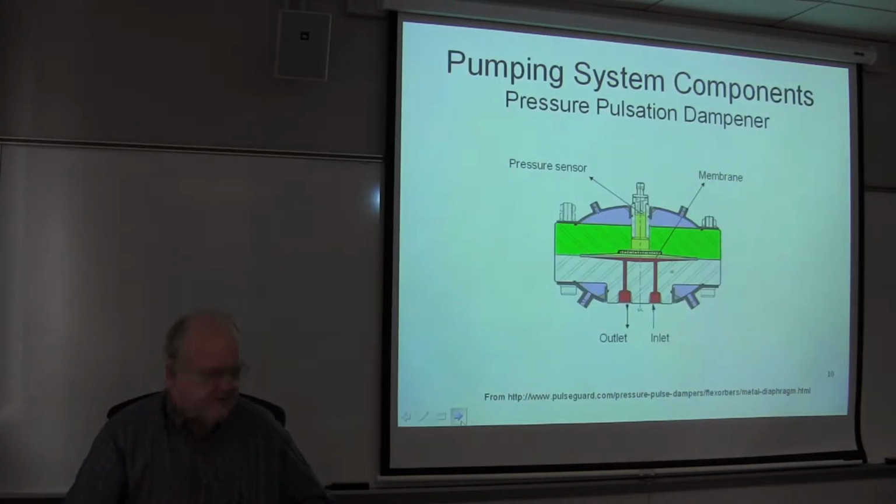Here's the pulse dampener system, and usually they also build a pressure sensor in there. You want to be monitoring your pressure on your system. If you see changes day to day, something's going on. The pressure pattern should be very reproducible from day to day.